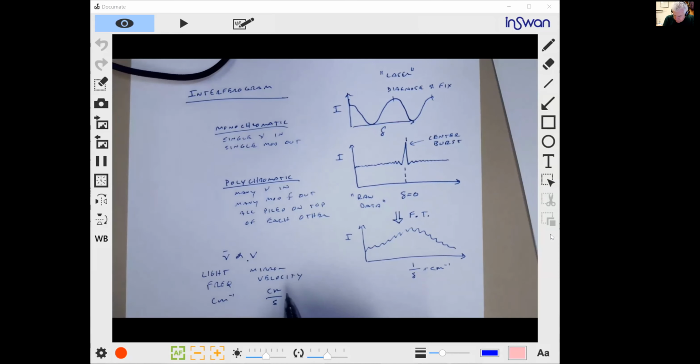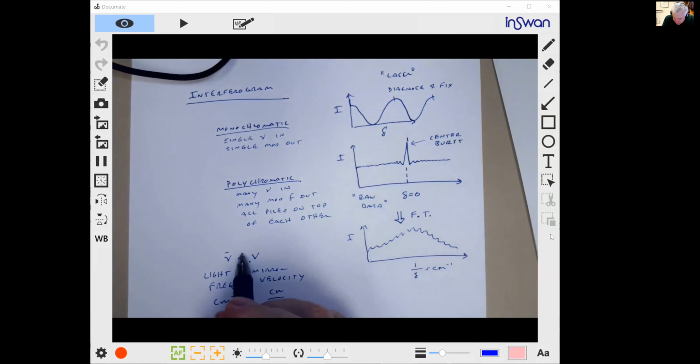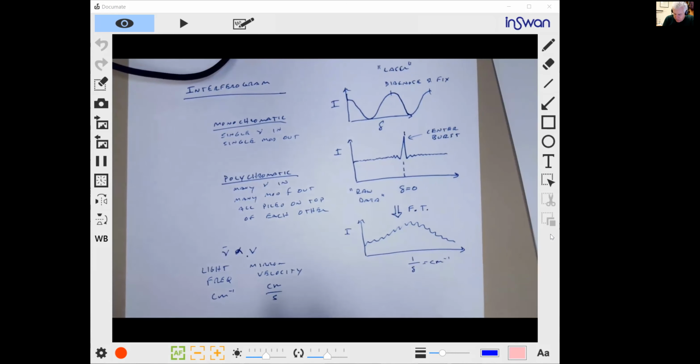And so, oh gosh, I'm not going to be able to pull this out. I have such good notes on this, but it's just not emphasized by Harris. So I think I'll just kind of leave this be, right? The light frequency is proportional to the mirror velocity, right? And I think I'll just cut to the chase here, right?